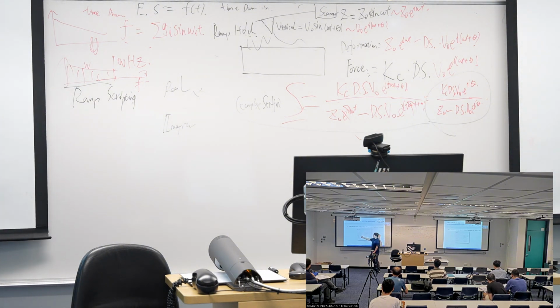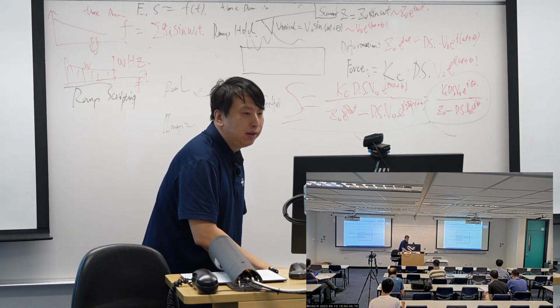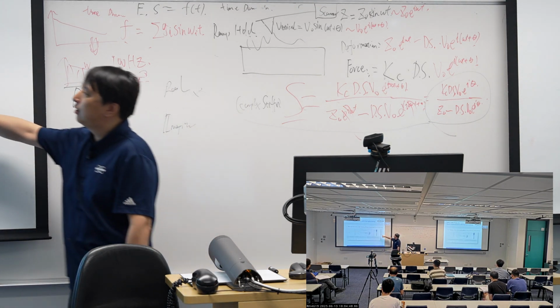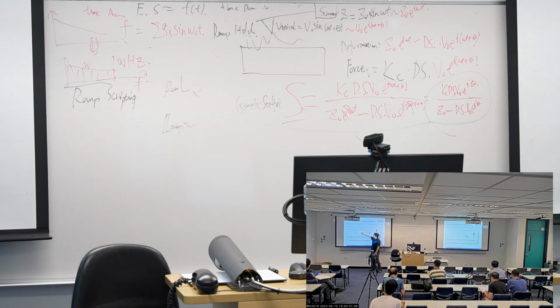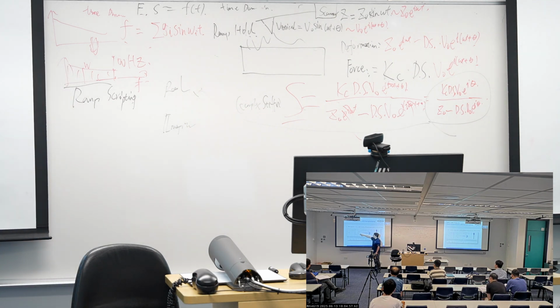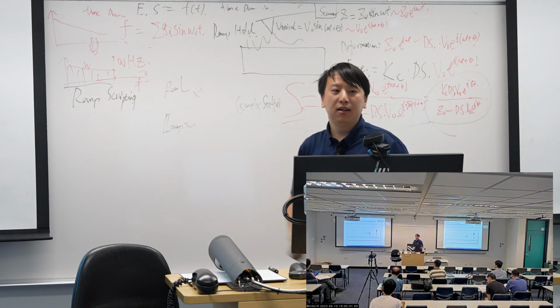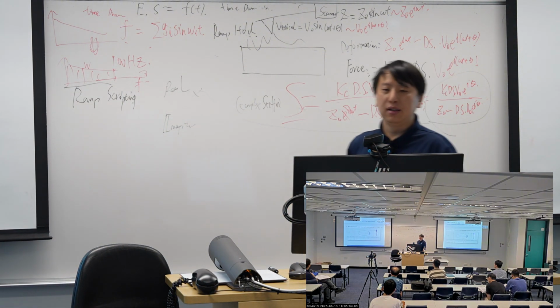You type the frequencies here, and we can generate a script. And during the hold, the probe will do the modulation at different frequencies. And that's how we play the nanoDMA games.